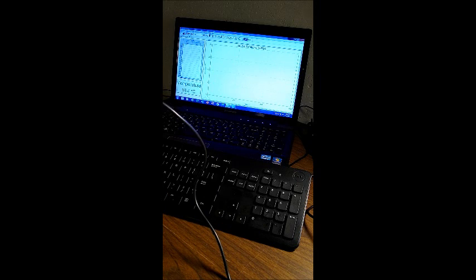So I will start, and let's see what temperature. We're at 16.4 degrees C. You can kind of see it here. Let me see if I can zoom in. I should be able to do that while I'm running this video. Maybe move the camera a little bit. So there you go. Now what I want to do is acquire a baseline. So I want to acquire about, I don't know, 100 to 200 seconds of room temperature. Room temperature down here is a little chilly.